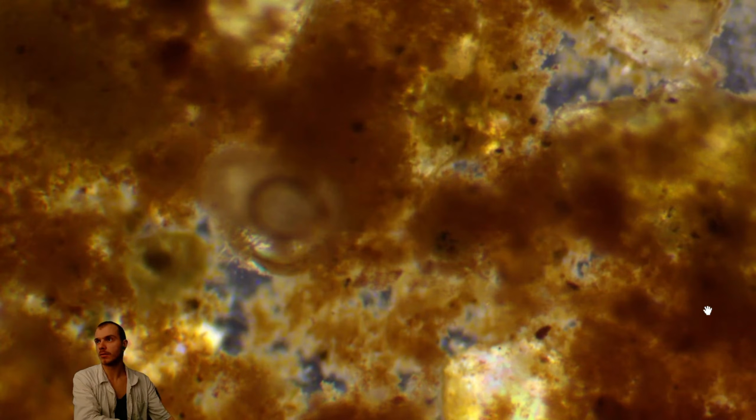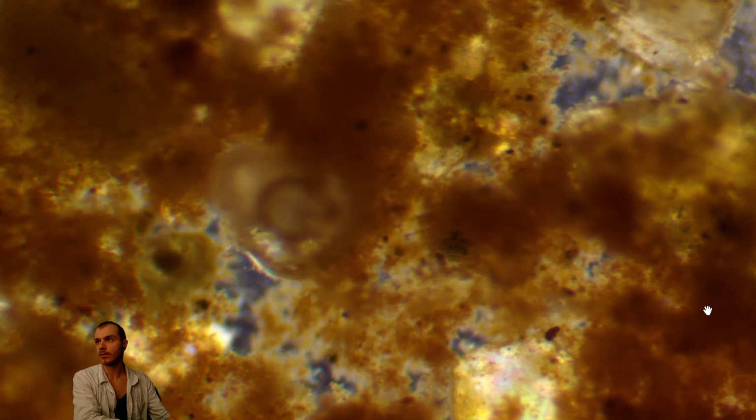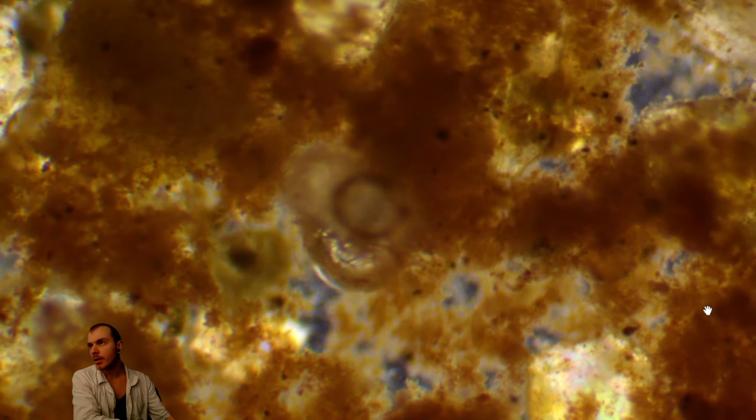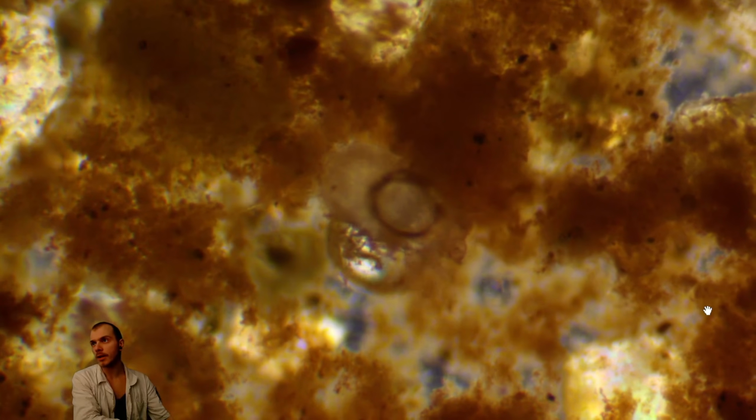What is this? I think it is a dust mite, but this one is capable of living underwater. I'm not sure if it is really dust mite or water mite, but looks like dust mite, yeah. So it just makes its bubble of air here, and it is like breathing from it.